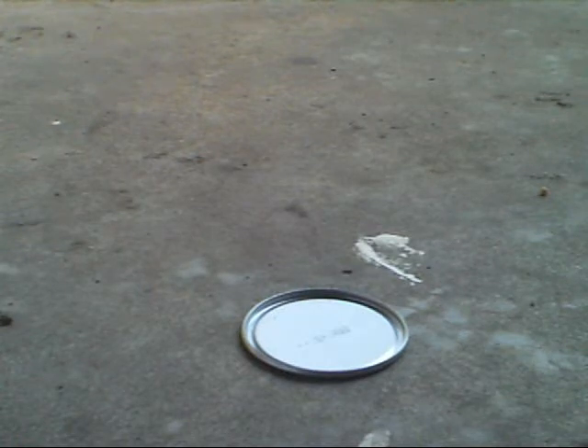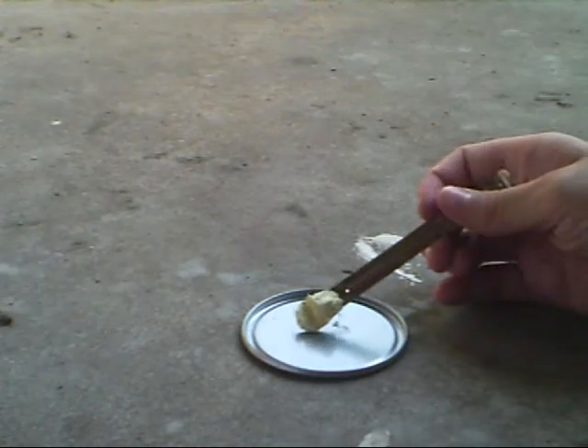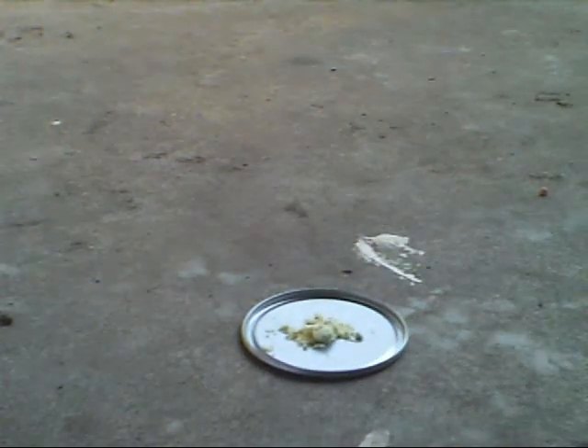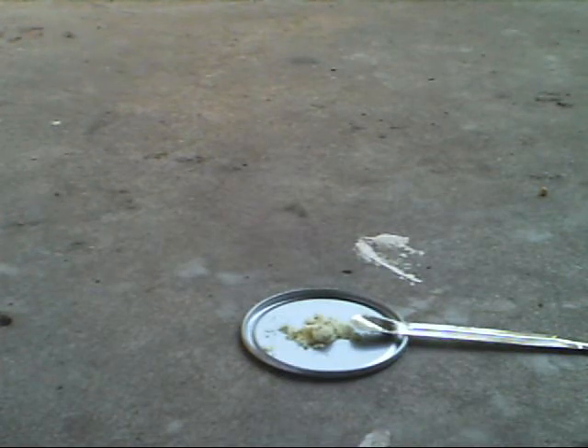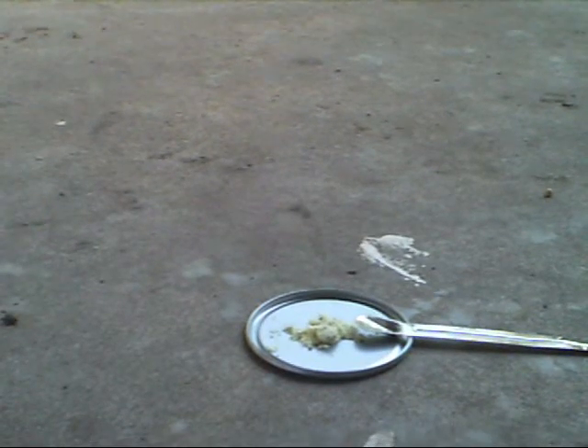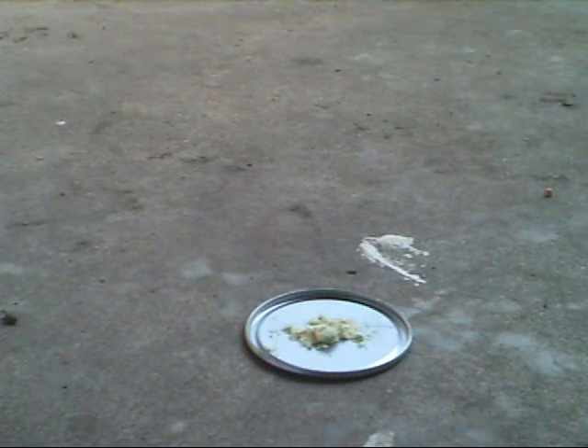What you're going to do is put a spoon or two of sulfur on the plate — that's probably good, about that much sulfur. And then you would take some iron filings and place about a spoon of them on the plate as well.